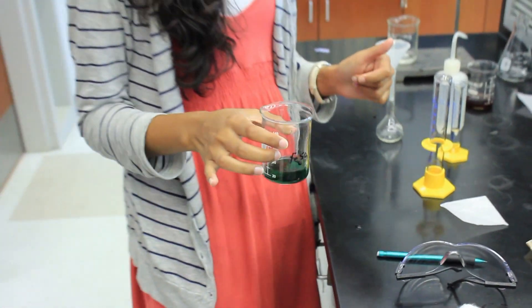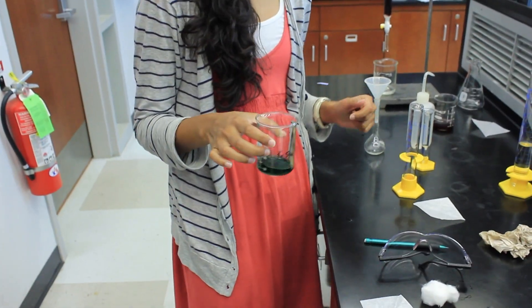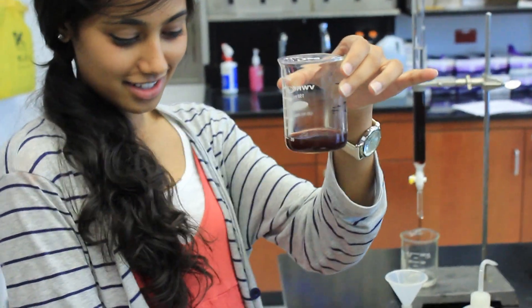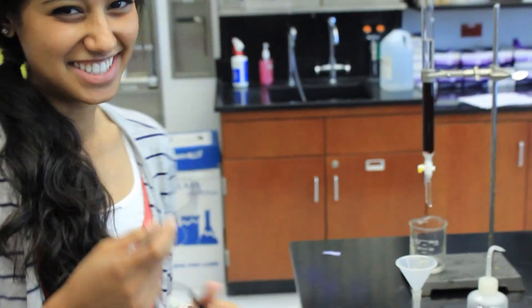You're going to swirl this for 30 minutes and eventually it's going to look like this. It'll be a deep red color, kind of murky. Oh, and you have to wear your goggles, so don't forget those.